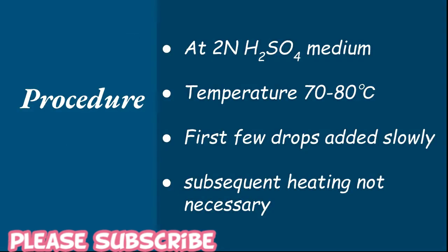Now let's come to the procedure. This reaction is done in 2 normal H2SO4 medium, and initially the reaction mixture is heated to 70 to 80 degrees centigrade, which is indicated by the first appearance of bubbles.